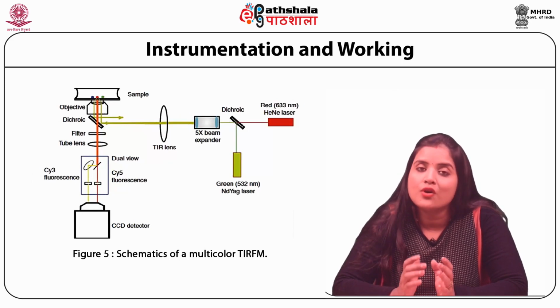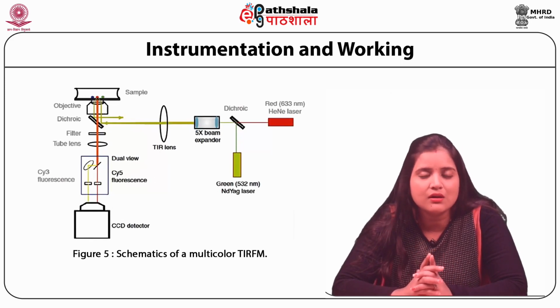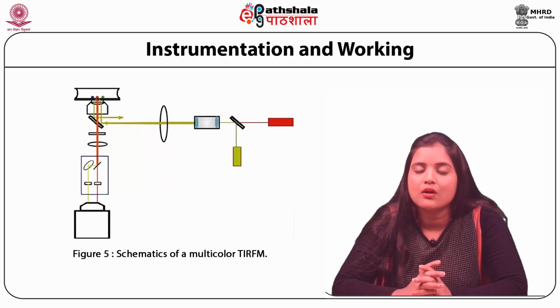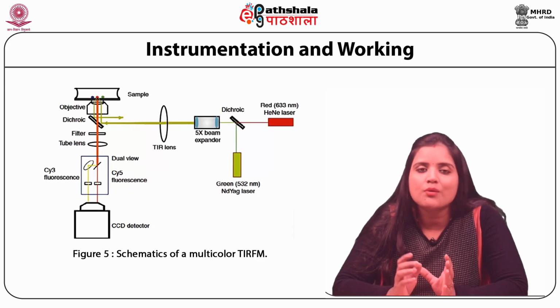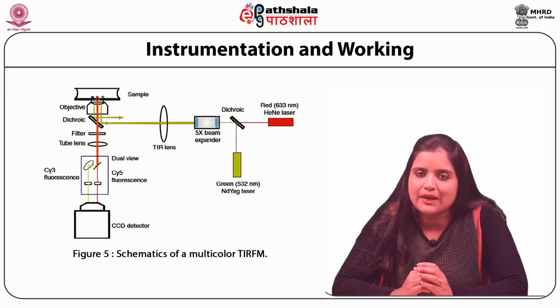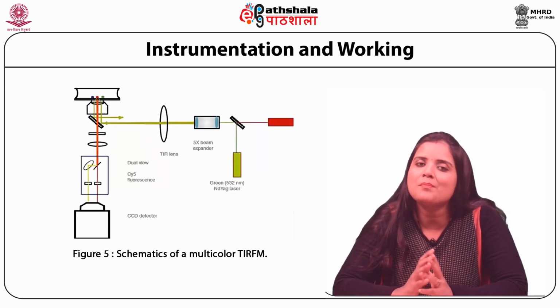A set of two irises are placed at the same height along the optical table such that the beams traverse the same optical path. The illumination spot is enlarged to about 60 micrometers in diameter by using a 5x beam expander on the XY translation stage along the optical path.